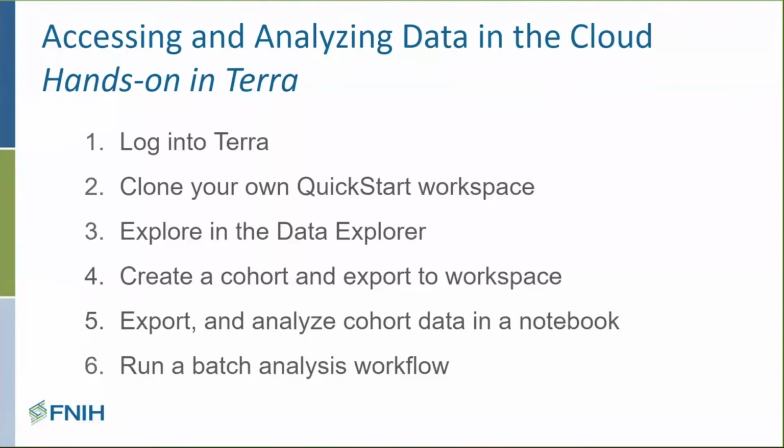We're going to take a side route to explore some data in the Data Explorer and push it to the workspace that you just created. And then we're going to take that data, analyze it in a notebook, and I can show you how that works. And then the last part, as I mentioned, is we're going to run a batch analysis workflow. And I'm hoping that it will finish in a few minutes, and you'll be able to see it finish.